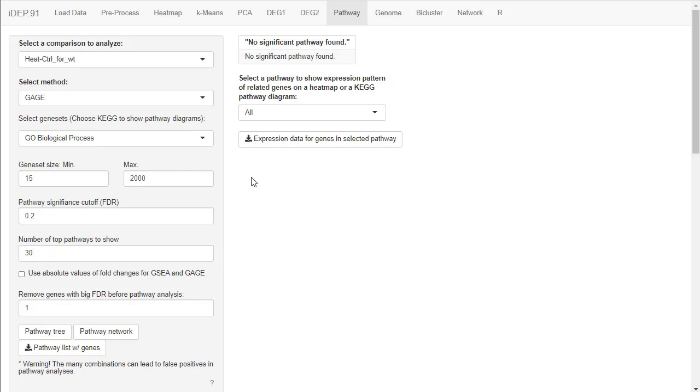We humans are typically very, very biased in terms of the things that we want to discuss and the evidence we want to see. So that's why I encourage people to verify your results. Just report the robust results. A robust result will be something that could be found using different methods, under different settings, and repeatedly. Not something so sensitive to a parameter that if you change it a little bit, it'll disappear.